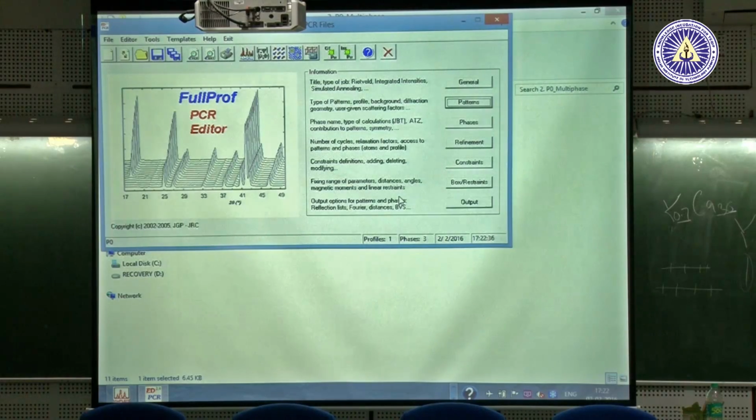A bit of digression, but how can you get tungsten and gold here? Tungsten is actually the material that, with ruby, will create the pressure. Okay, so it's like a diamond anvil cell, sir. Yes, sir. So there comes tungsten. And gold is also there. Tungsten is more like a gasket, yes, sir. And gold is where your powder is mixed, and you apply pressure from outside. Okay.